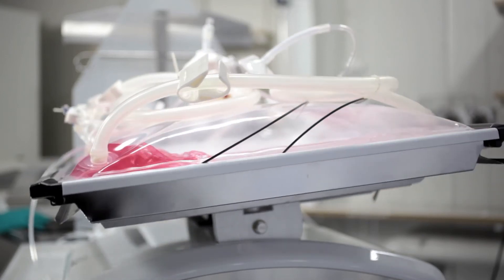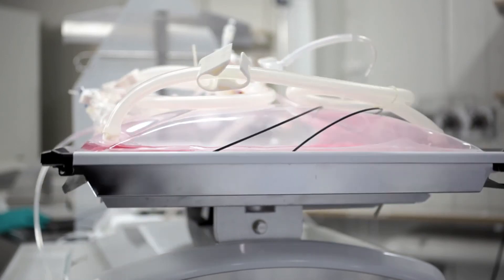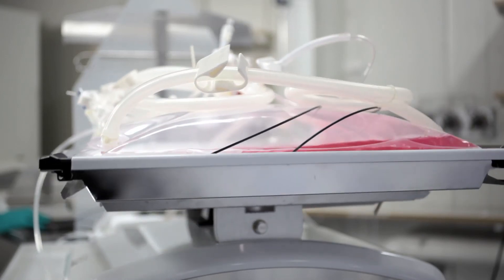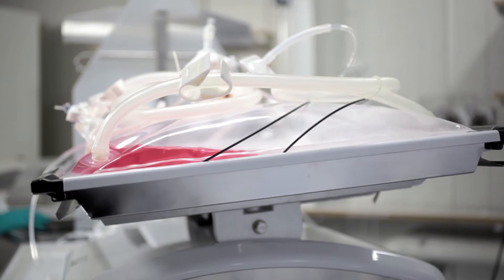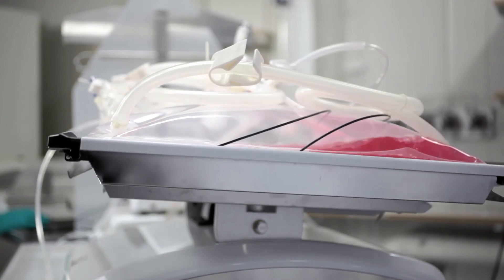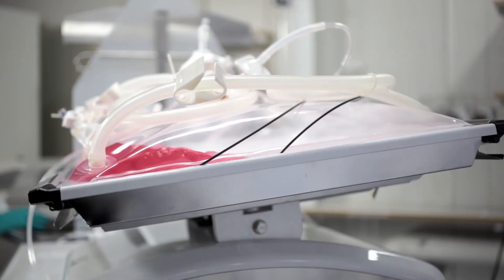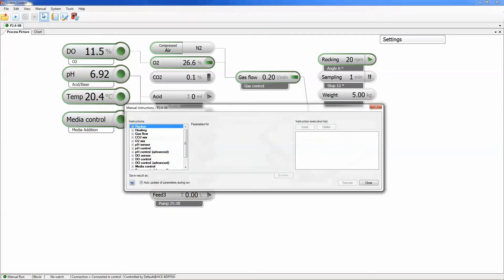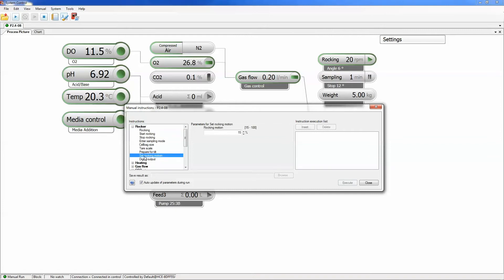The mixing and the gas transfer in the cell bag bioreactor are managed through the three rocking parameters: rocking speed, angle, and motion. The parameters can be set using default settings, or set to fit a specific requirement of your cell culture.